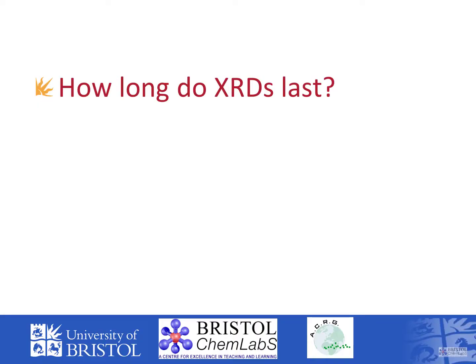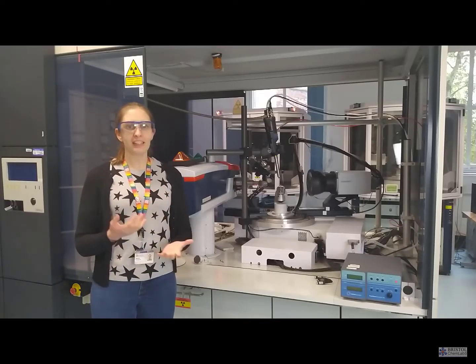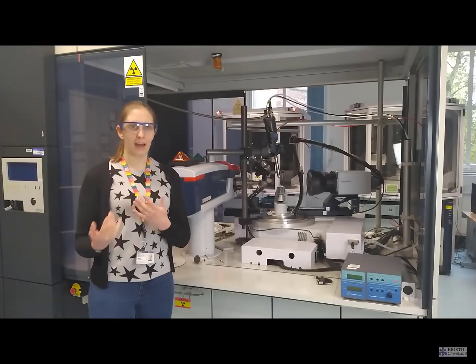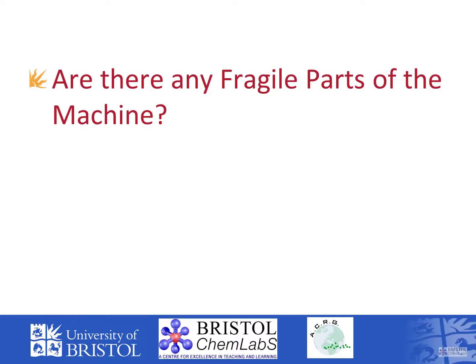That depends on the instrument, so you're looking somewhere between about 300 and 500,000 pounds. These instruments can last roughly 10 years. Often they can last longer than that, but generally the manufacturers will suggest 10 years.